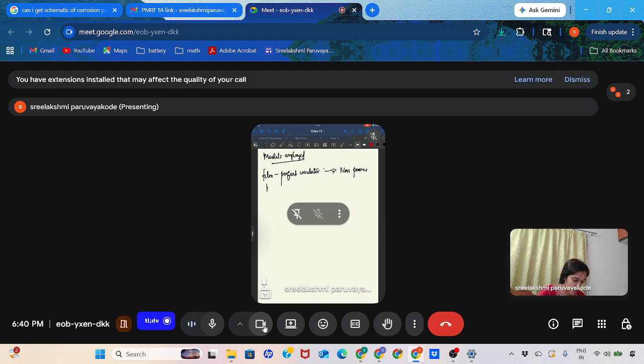So when it's non-porous, what happens? It blocks the complete electrode surface. So this is the case. You have the electrode, it's an insulating, non-porous film. And then you have the electrolyte. So it wouldn't allow the electrolyte to penetrate it. Because they are well separated, I can use a model where this will have a capacitor.